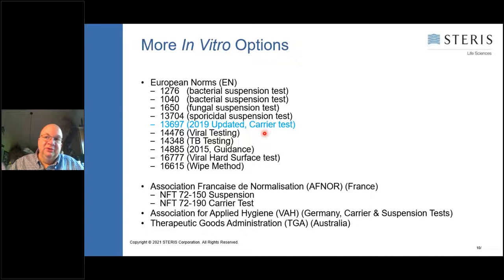Another key thing is when using a soil load with the disinfectant part of the testing with the vegetative organisms, no longer is skim milk in there. Now you're actually using a serum soil load in there, so you can get better test data with organisms like Pseudomonas aeruginosa. In the past, that skim milk made it nearly impossible to pass the testing. So that's a good thing to know.